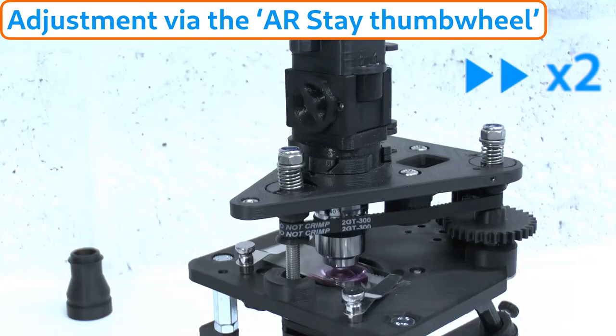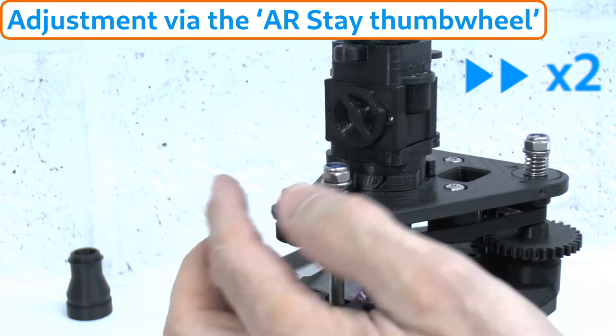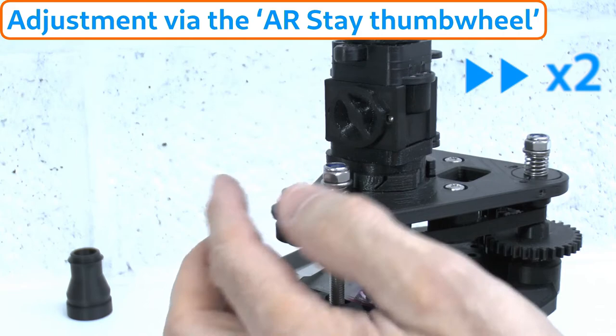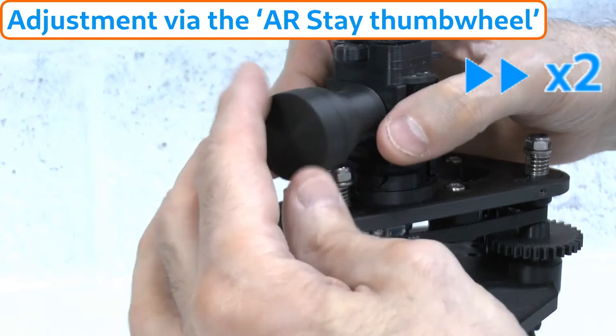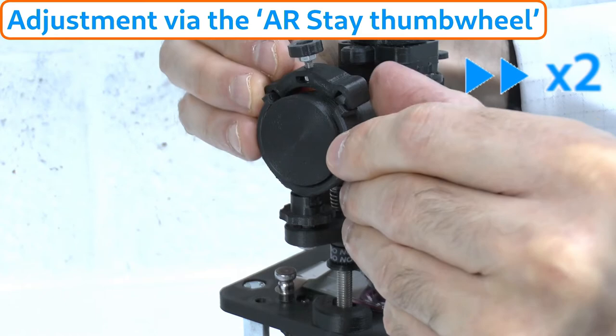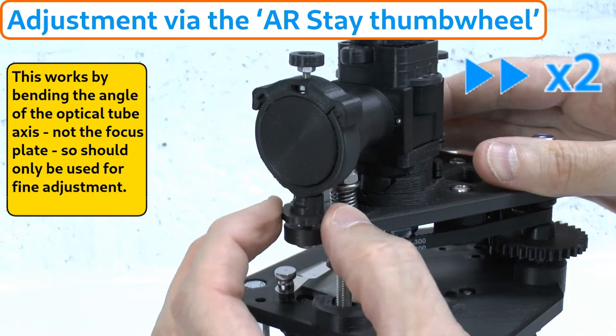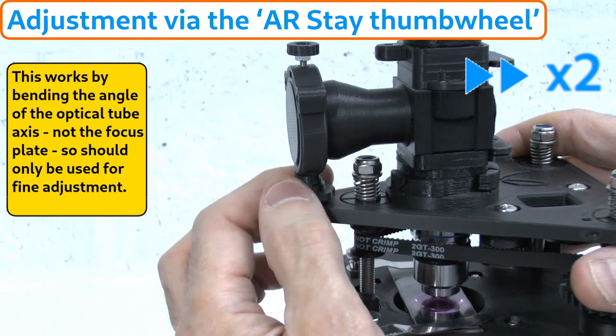For anyone using a Puma microscope with the advanced filter block, there is an even quicker and more convenient method to effect front-to-back axis correction using the front AR stay thumb wheel mechanism. This mechanism was devised to prevent the bulky augmented reality projector from tilting the optical tube due to its weight and to reduce vibrations. You don't need an augmented reality projector fitted to use it, because the epi black body modules (colloquially known as light sinks or black holes) are also designed to fit this same thumb screw attachment. More will be said about this mechanism in separate tutorials on epi illumination and the augmented reality module.